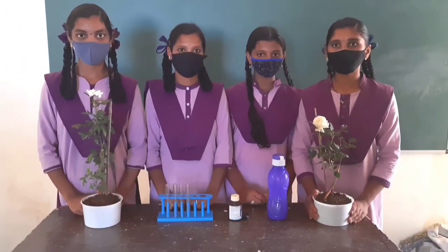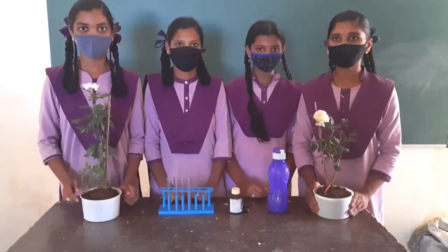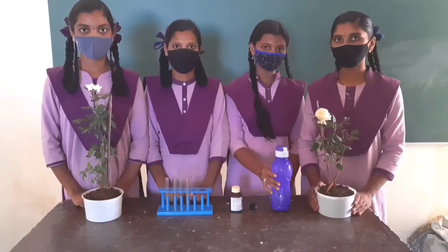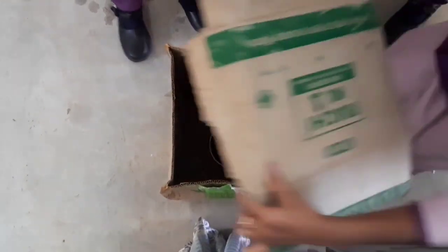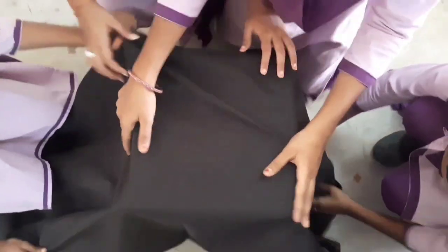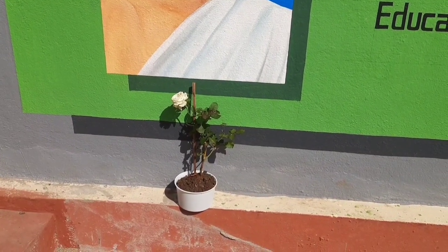To do this activity we need two potted plants of the same kind, two test tubes, iodine, a dropper, and water. First, we keep one potted plant in the dark. For this, we keep the plant in a box and cover it with a black cloth so it doesn't get exposed to sunlight. To get the best results, we keep this plant in the dark for one week. Keep the second plant in sunlight.